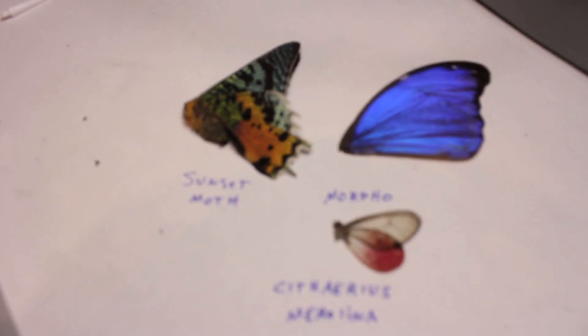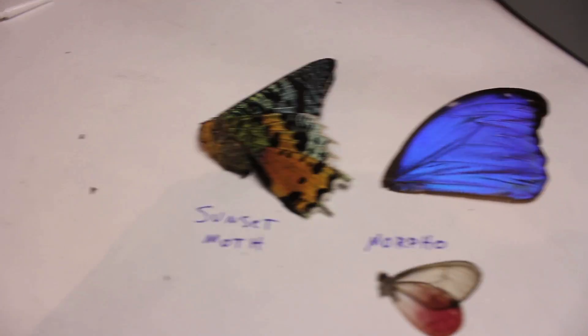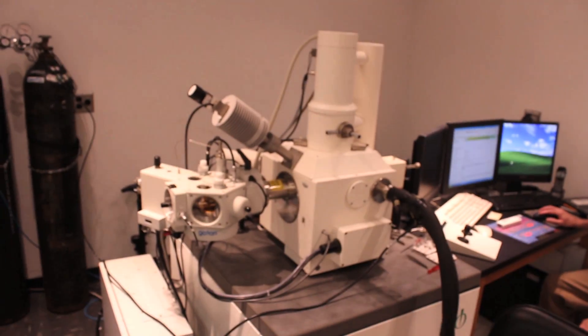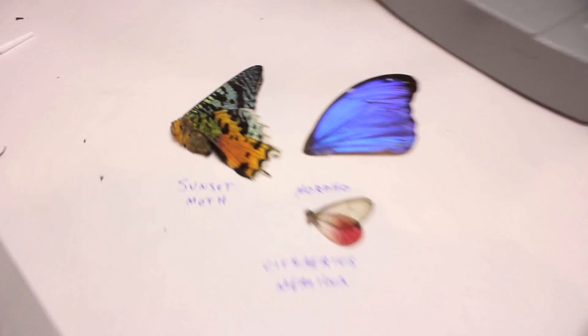Time for science. Goggle up. Probably the coolest goggles I've ever been given. Here's the question: we have three different types of butterfly wings. We have a sunset moth, which technically isn't a butterfly. We have a morpho butterfly wing and then we have a cythereus. Dr. Simmons is going to use the scanning electron microscope to show us the difference in the wings.